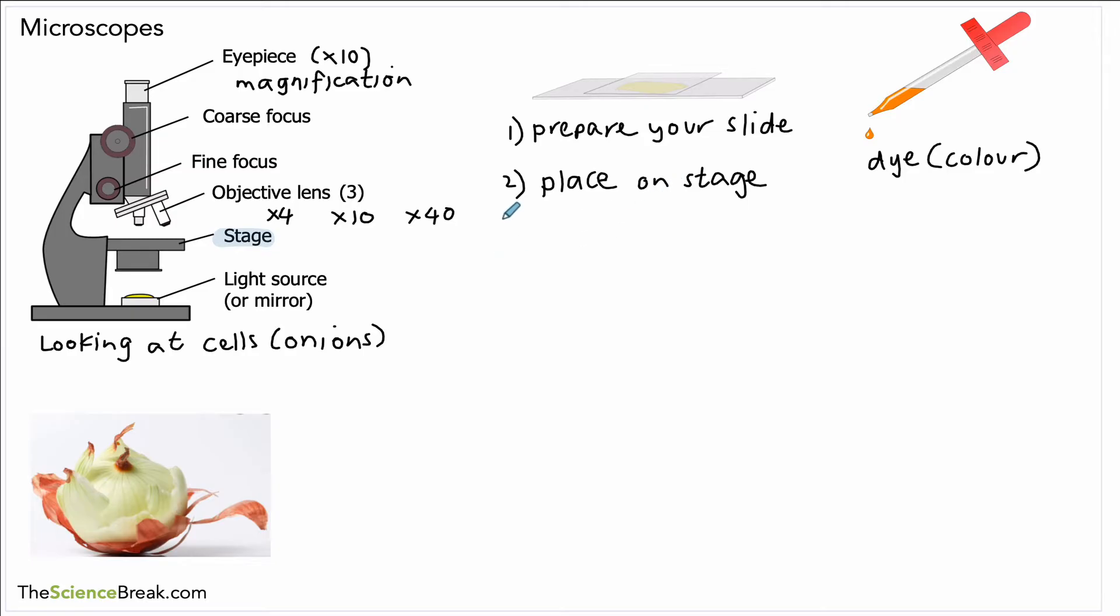Then we would use our smallest objective lens - in this case it's times 4 objective lens. Then we would use the coarse focus to bring the stage up as far as it will go. Don't force it more than it will go, but we bring it high up as far as it will go.